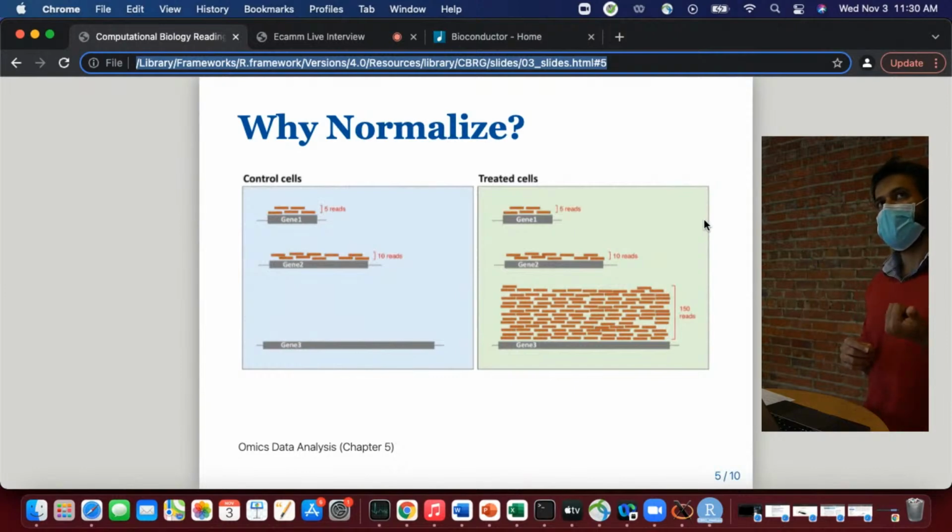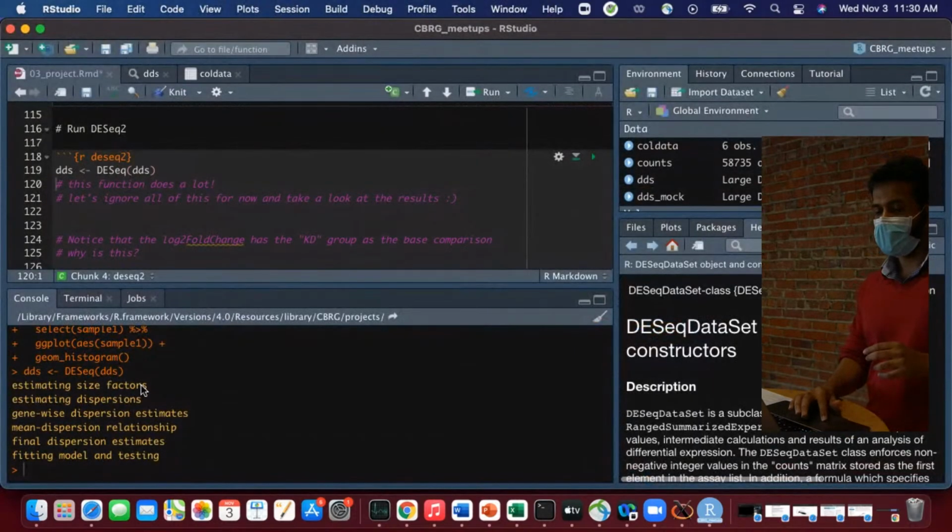One thing worth bringing up is there are many different ways to normalize count data, TPM, CPM, and so on. Unfortunately, a lot of those already normalized data cannot be used as input for DE-Seq 2. The package and paper even warn you that you will not get a sensible output. And so it's critical when using the DE-Seq 2 package to begin with unnormalized raw count data. So that's the size factors, estimation of these size factors contributes to this normalization process.